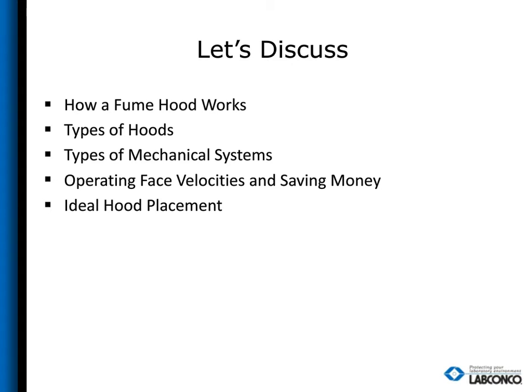Here's our agenda for this webinar. First, we're going to make sure we're all on the same page and discuss components of a fume hood and how a fume hood works. And after we have that settled, we'll talk about some different fume hoods and different mechanical systems. And then we'll finish up by talking about fume hood performance and a little bit about placement.